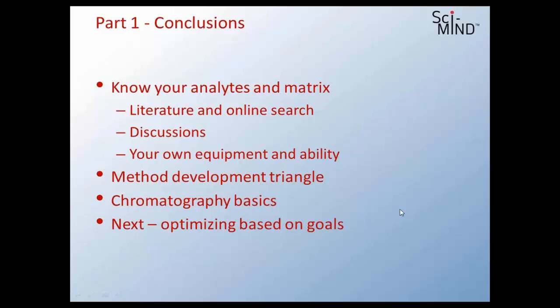What is my preferred GC stationary phase? When I'm starting a method development, I like that one. I also like the 5% phenyl, which most people know as usually some code followed by a number 5. That tends to give us just a little bit more selectivity for aromatic compounds and for compounds with some polar functional groups, which we often want from the start. So that's also a very good question. So please, let's have a few more questions.